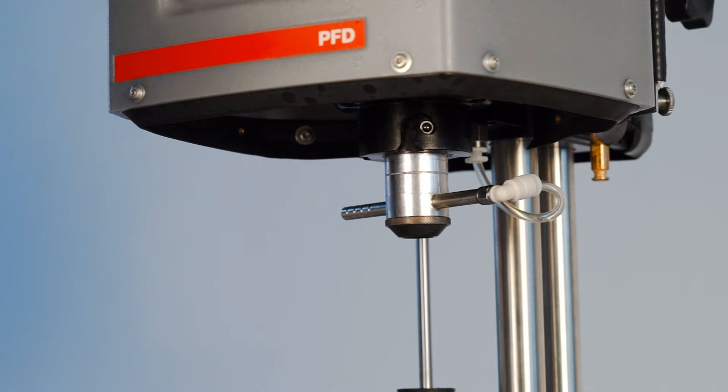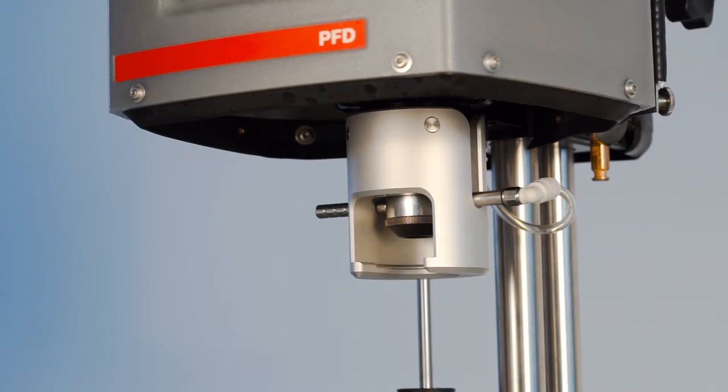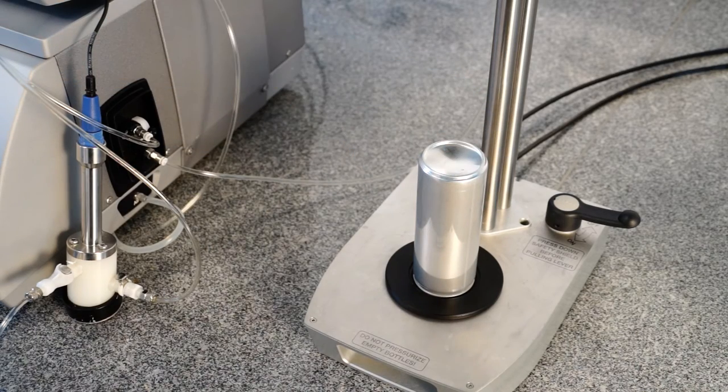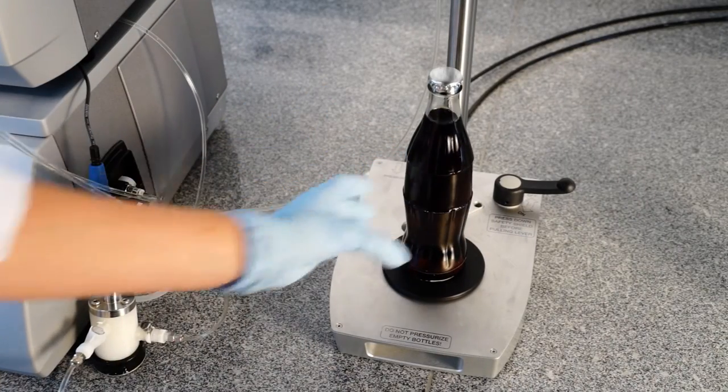For PET bottles, please install the adapter on the piercing and filling device. Cans need to be placed upside down. Glass bottles can be inserted as they are.